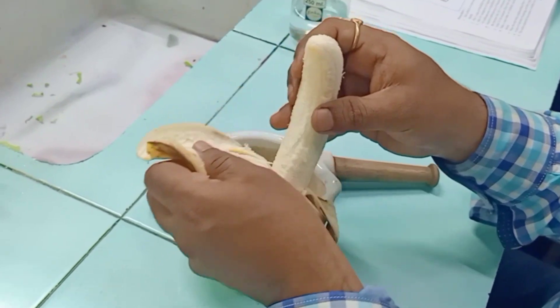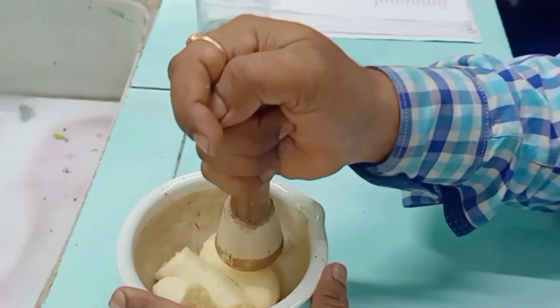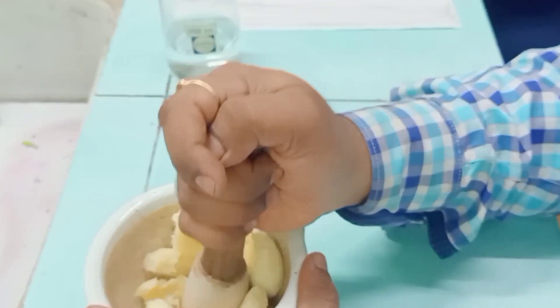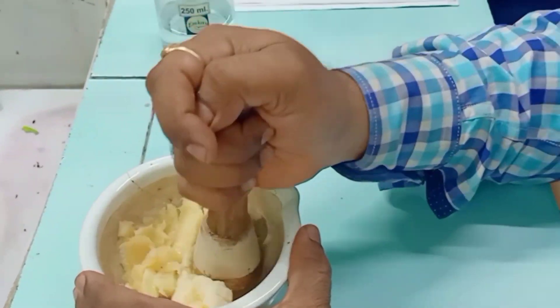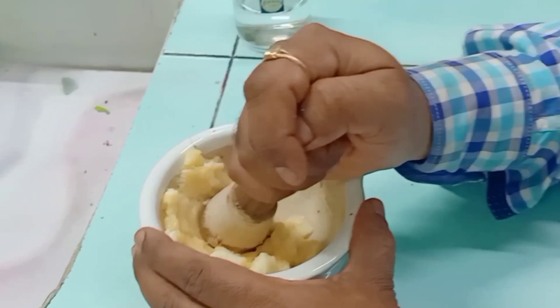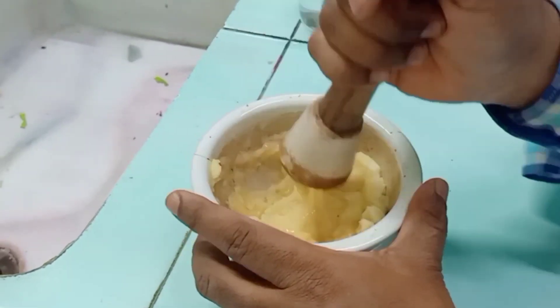Let's get started with the principle and procedure. We have taken a banana, we peel it off, and we are going to crush it using a mortar and pestle. We have to crush it in such a way that it becomes a pulp — a thin slurry of banana.